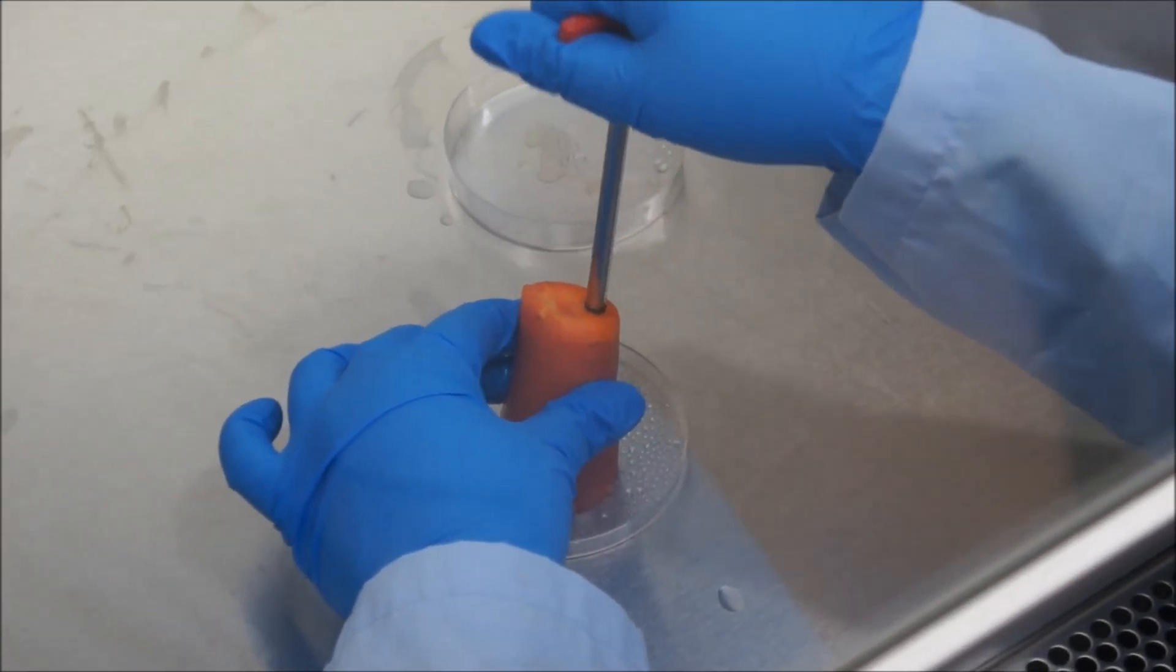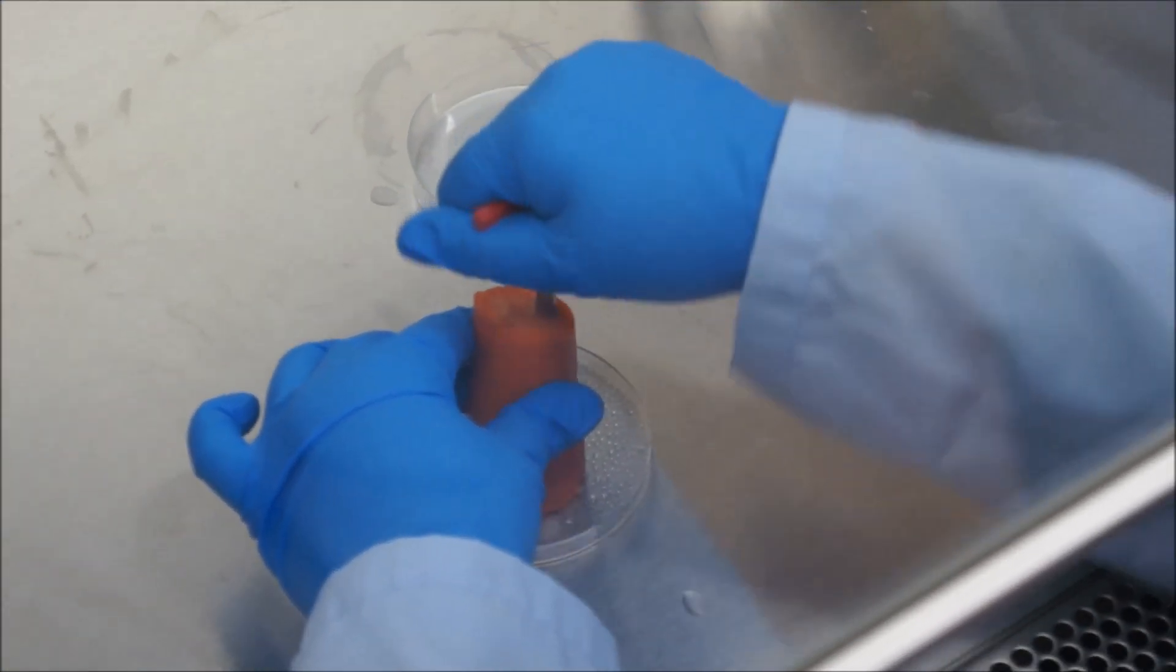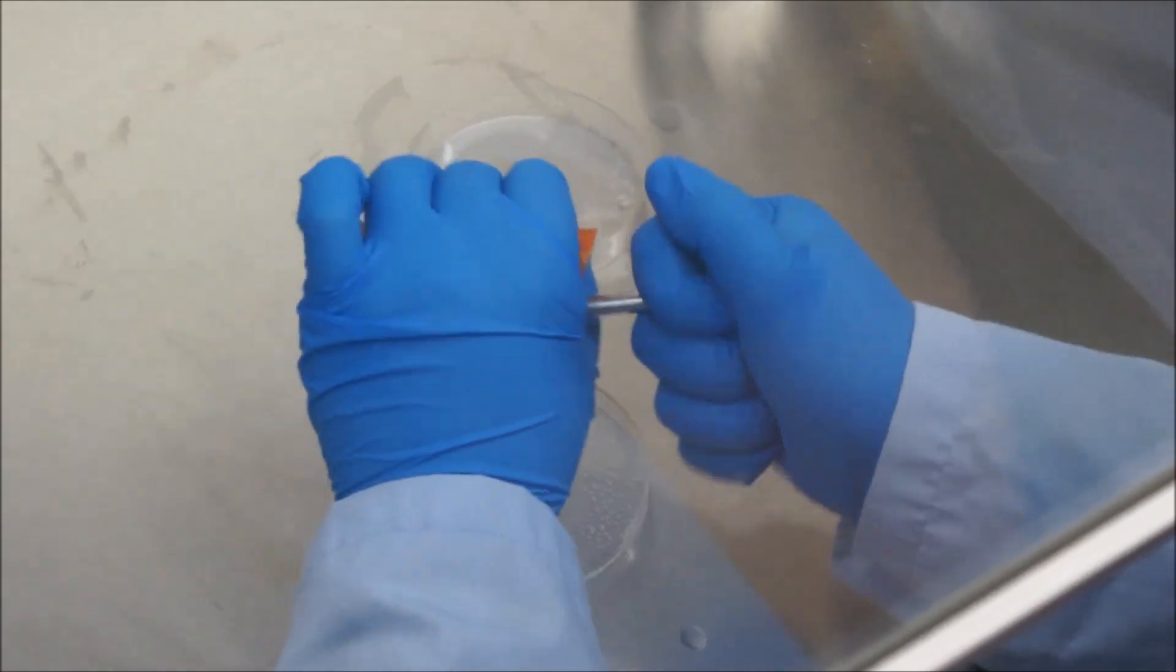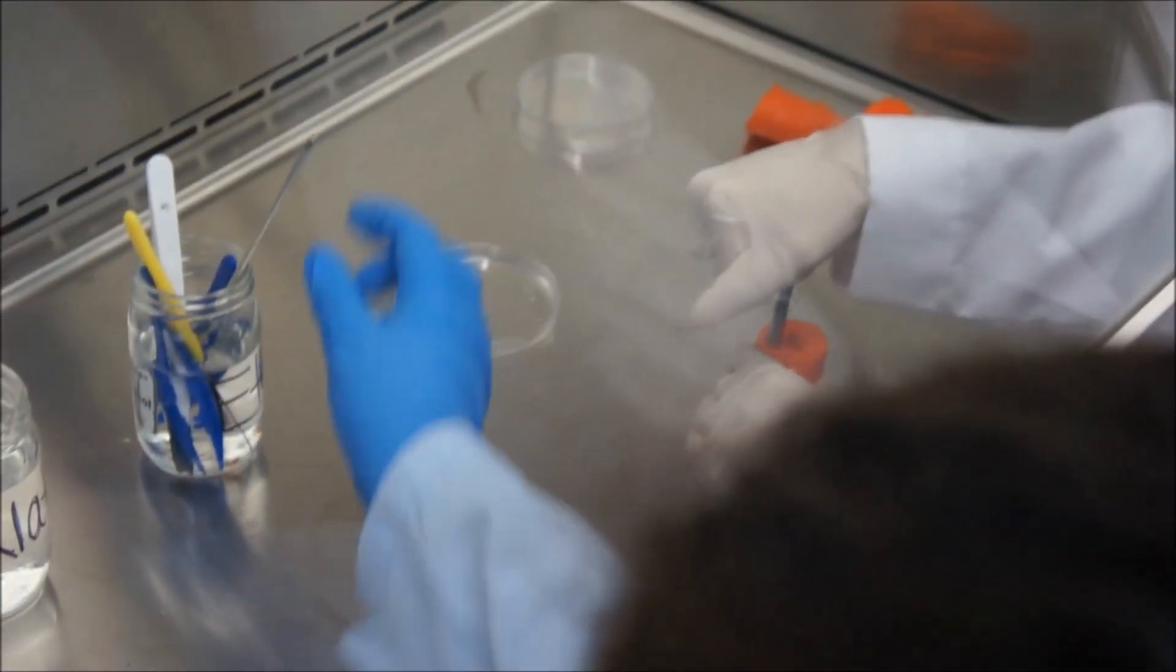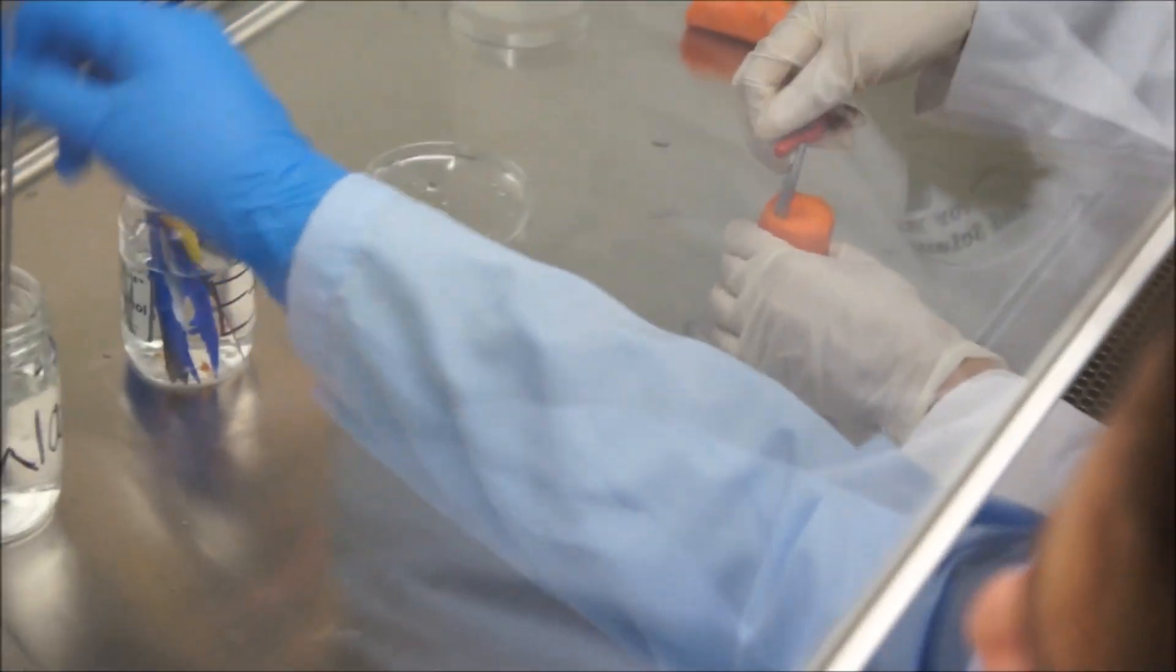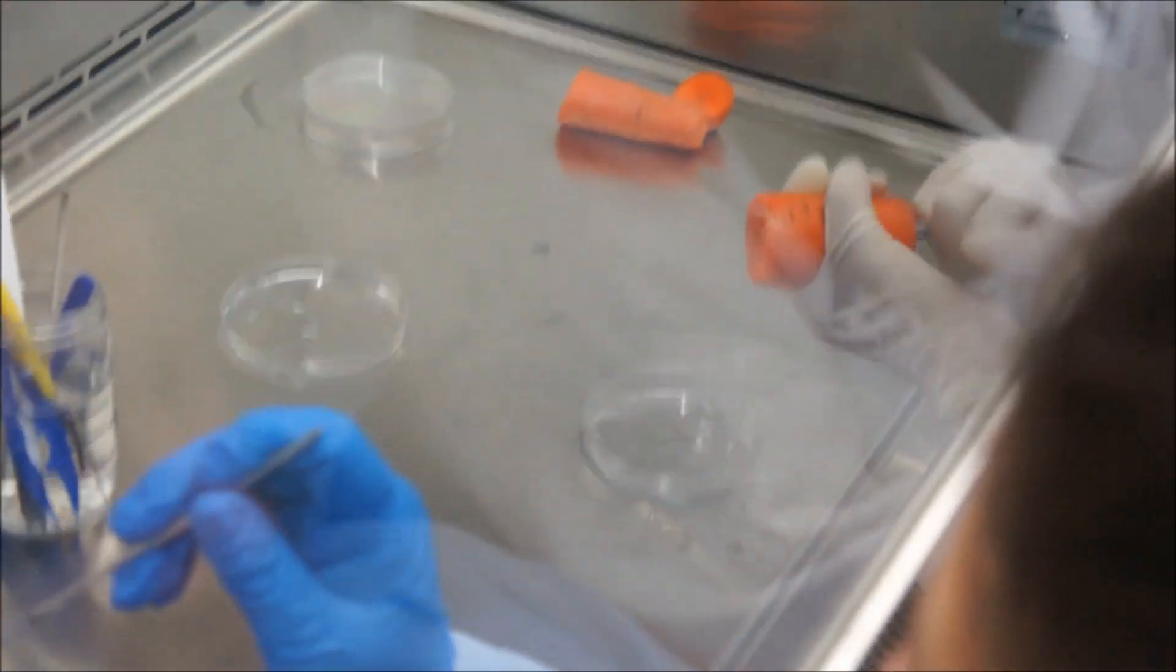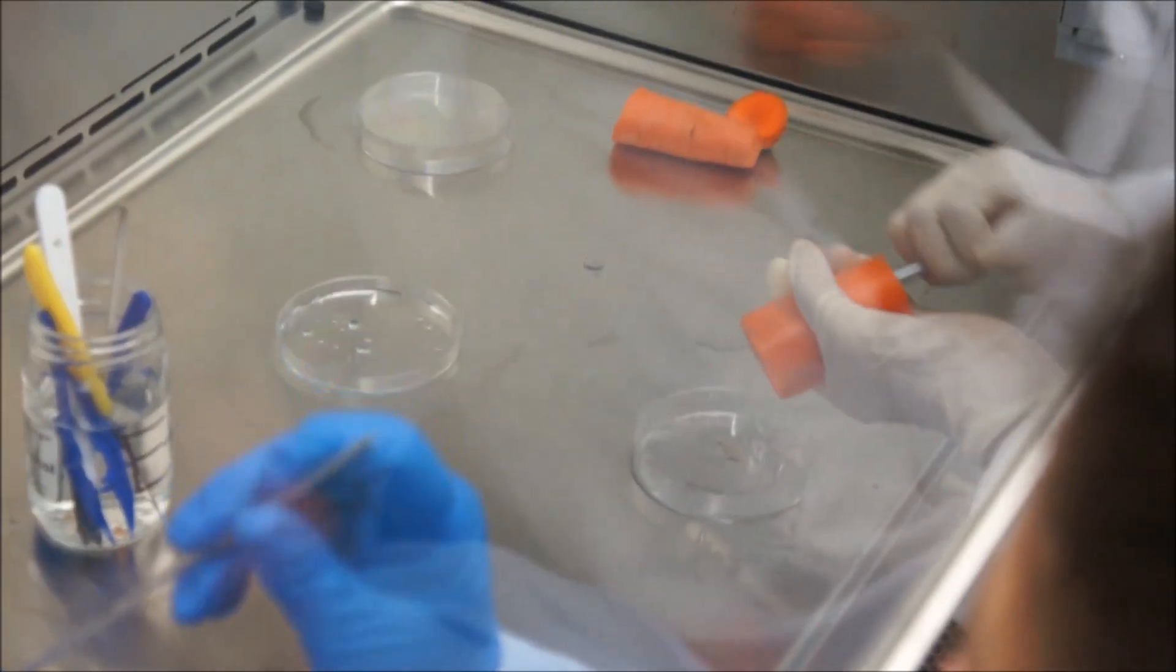While holding the carrot in place, push the cork borer into the region outside of the central core of the root. Be sure the borer goes all the way through the root until it is in contact with the dish. Turn the borer several times while gently pressing down to be certain the core is free. Pull the cork borer out.